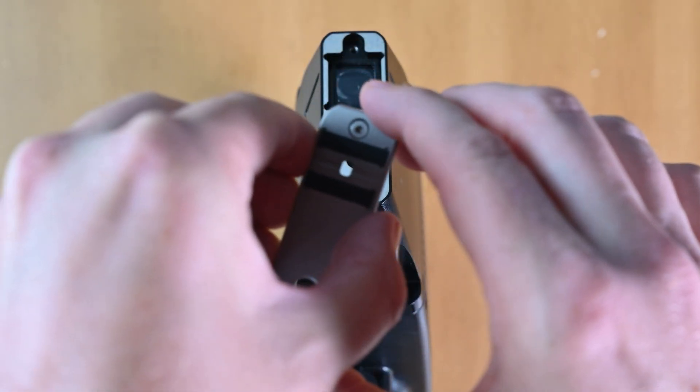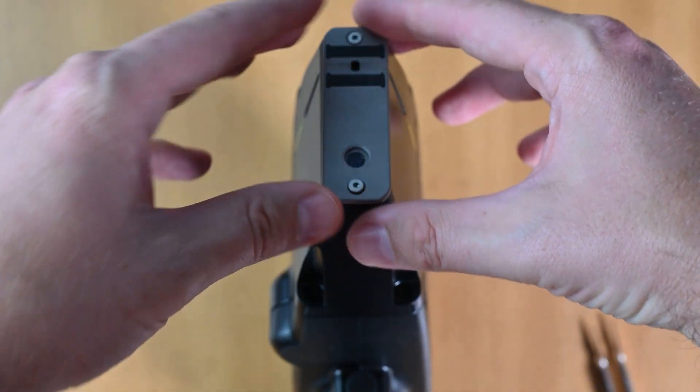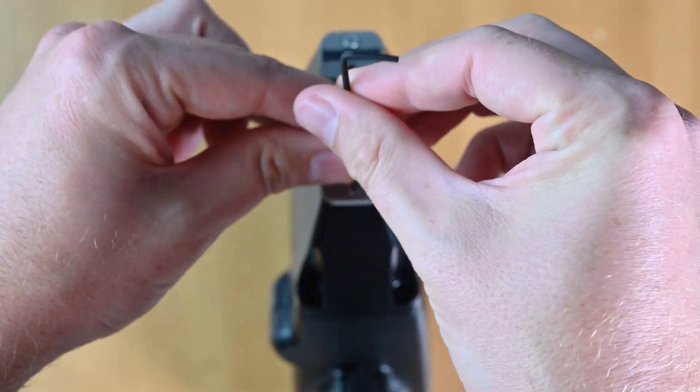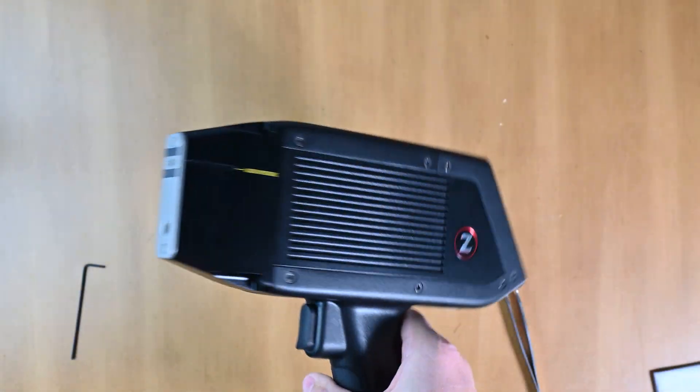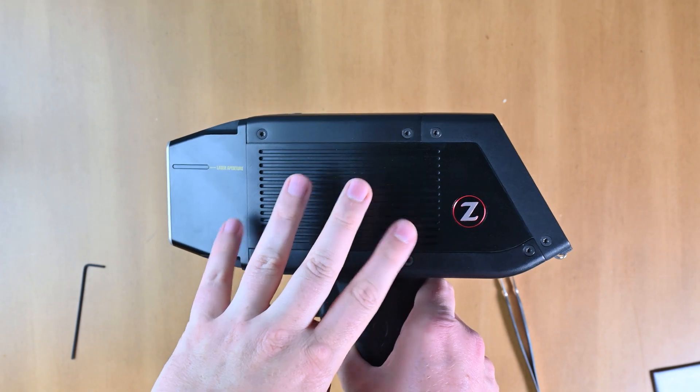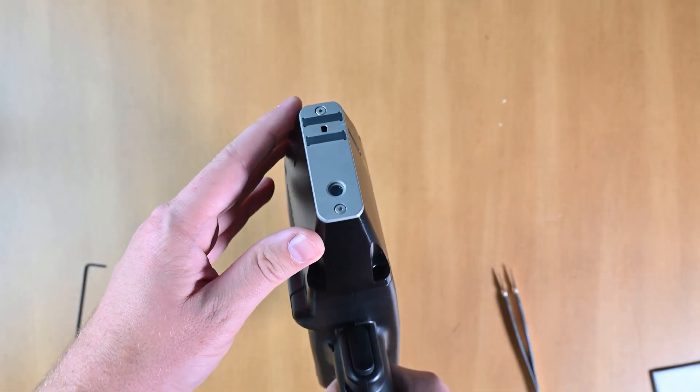So the next step is just the reverse of what we did to start. And there you go. Your PSYOP Z series handheld LIBS analyzer has now been cleaned.